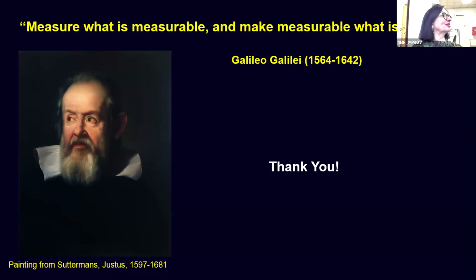I have an equation, I fitted this model, and I put effort into having some ideas about the parameters, so I do not arrive at the conclusion that my mass is negative or something moves higher than the speed of light. So more or less the parameters which I got, to my knowledge, are not entirely stupid. And then still my fit is not good.